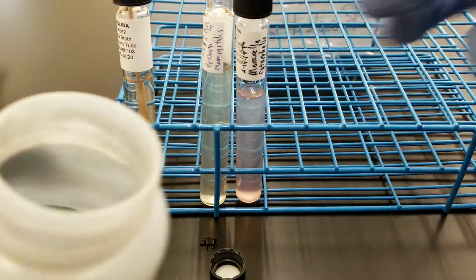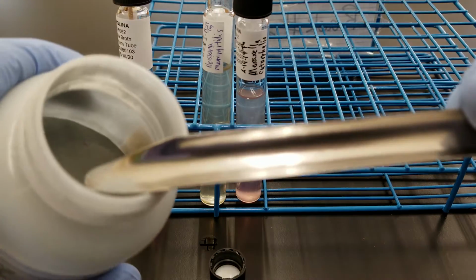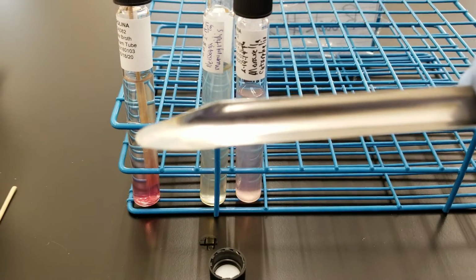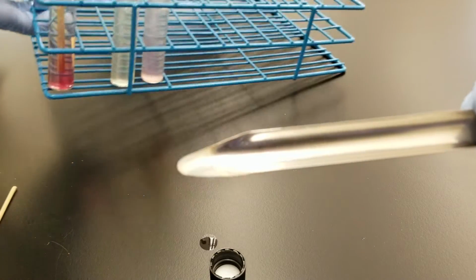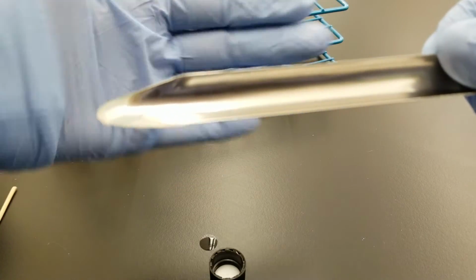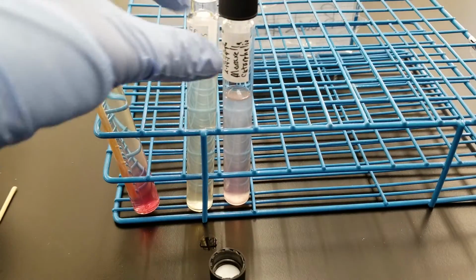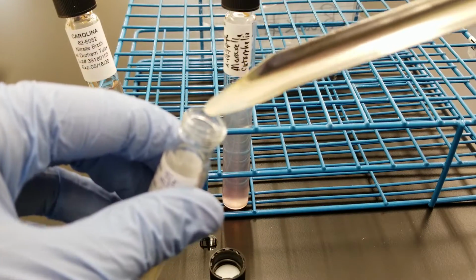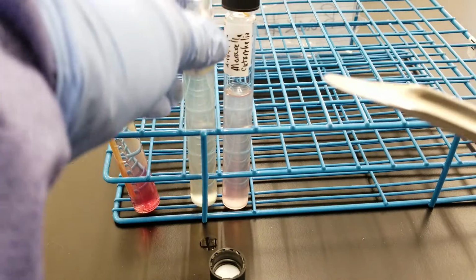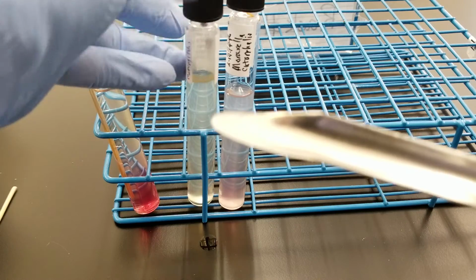This is a little more challenging because, you know, everybody wants to dig a lot out of there. Okay, so trying to focus here. There's just a little bit in there. Come on, camera. All right, well, I don't think that you can see that very well, but there's only a little bit in my spatula. Okay, it's supposed to just be a pinch. I shoved it in there. Now, I definitely need to clean this from the reagent, but also I just touched the mouth of the tube, so that's not good.